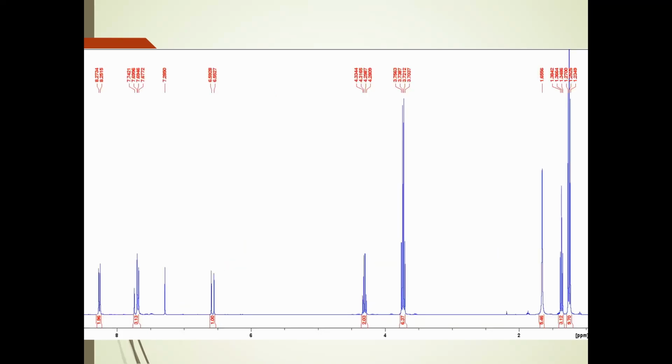This is another spectrum that, in fact, most of your spectra look like this. The thing to note that's different from this one from the others is we actually have 2 quartets. We have a smaller quartet and a larger quartet. We have a smaller triplet and we have a taller triplet. If you look at the integral ratios, these are really nice. This 2 to 3 to 2 to 2 to 3.